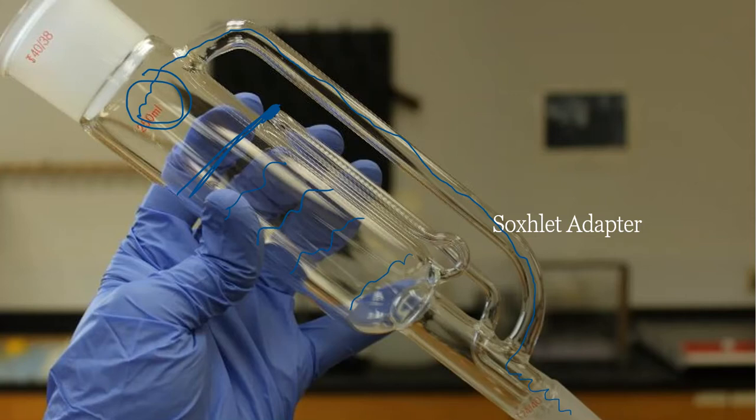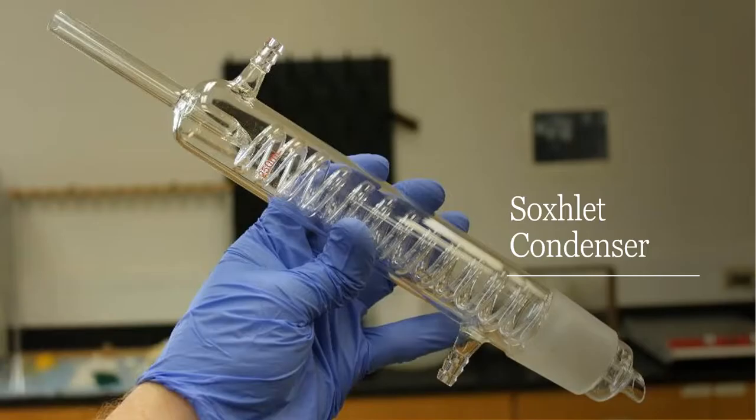All right. So in the next picture, I have this Soxhlet condenser, and the Soxhlet condenser will condense, go figure, right? So cold water will constantly rush through this Soxhlet condenser, and this is what changes the vapor into a liquid, so that way that liquid can go into the vat where my thimble will end up being that will hold the peanuts in the Soxhlet extractor.